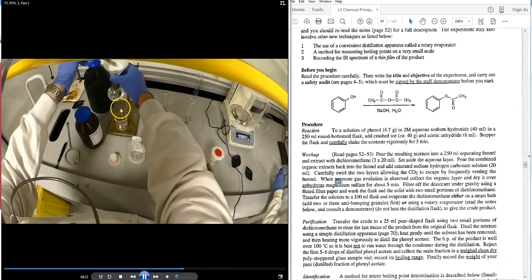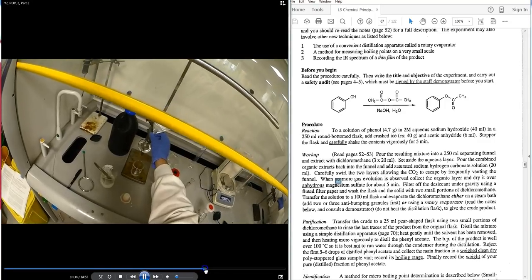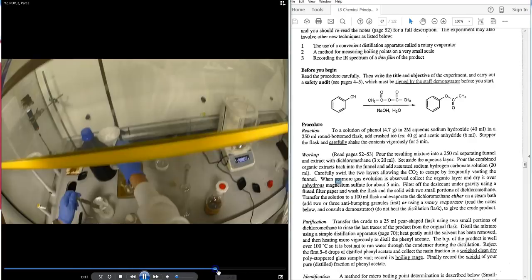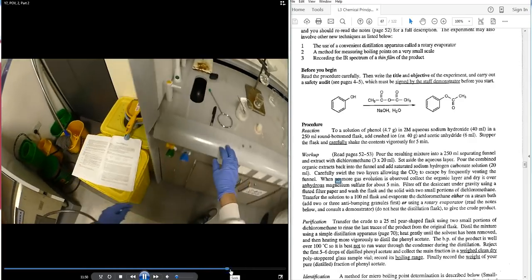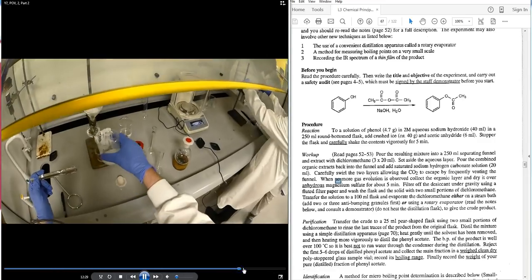This flask is then taken to a rotary evaporator to remove the DCM solvent.